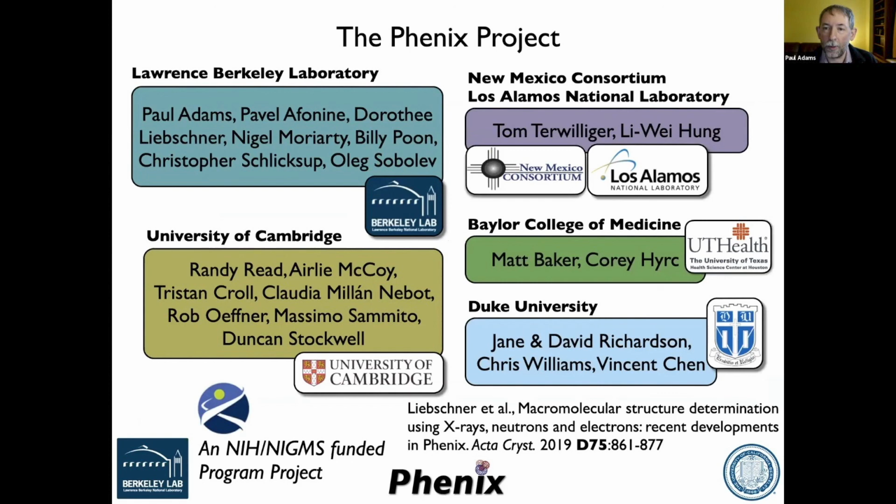because they're the only thing that lets you use clashes and hydrogen bonds accurately in the refinement. And the hydrogens don't fall off any more than the side chains do in the actual protein or nucleic acid.